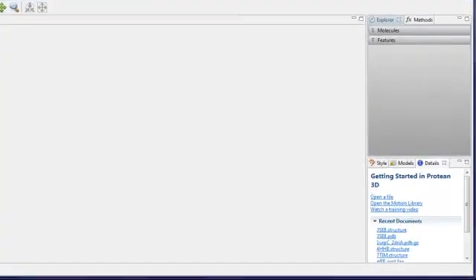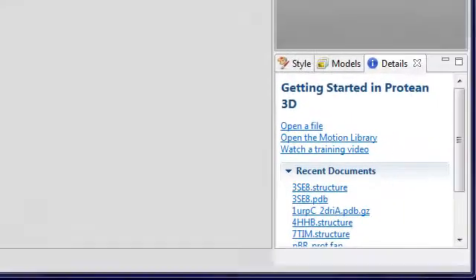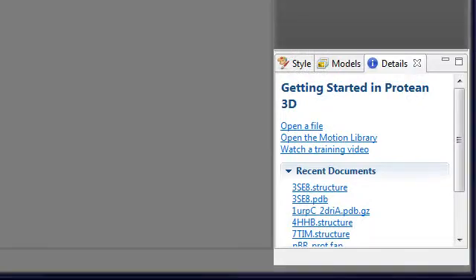To get started, open a file in Protein3D by clicking on one of the quick links from the Details panel.